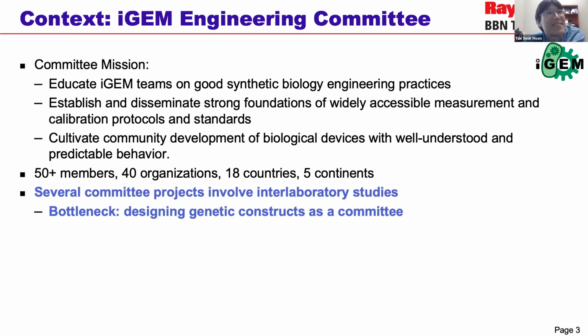And we are doing a number of experiments to try to get some areas where that's going to be much more predictable in many people's hands. So the same sort of thing that Chris Voigt has done with Cello, only for a wider range of things, and in a lot more people's hands, with units that they can directly compare to molecular models.